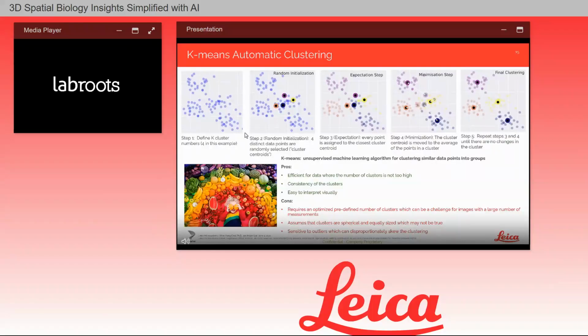The way it works is when you have data points as you see here, user has to define the number of target clusters, in this case 4. The next step is random points are chosen as the centroids as you see here. Then all the points that are closest to each centroid are assigned to them to be the member of that class. And the next step is when the centroids are then moved to the average of all the points in that cluster. When that movement of that centroid happens, some of the points may now be closer to another centroid.